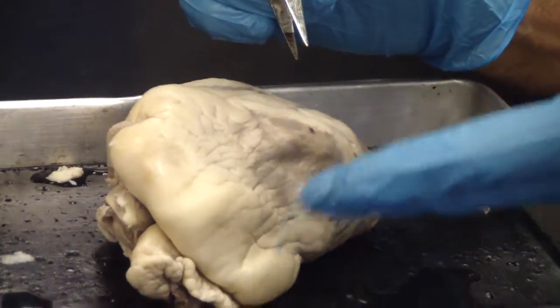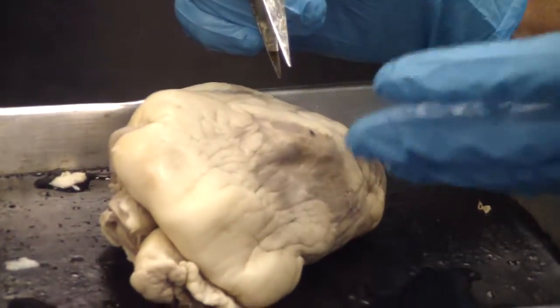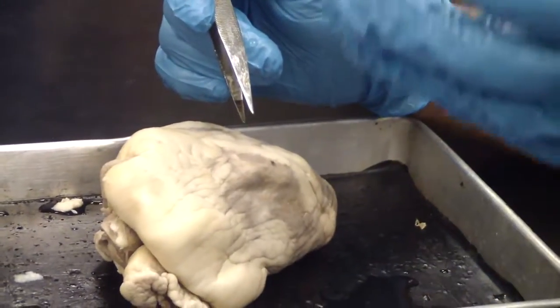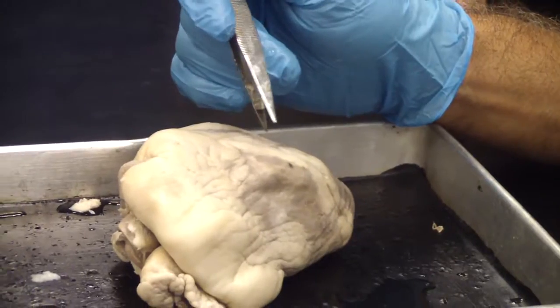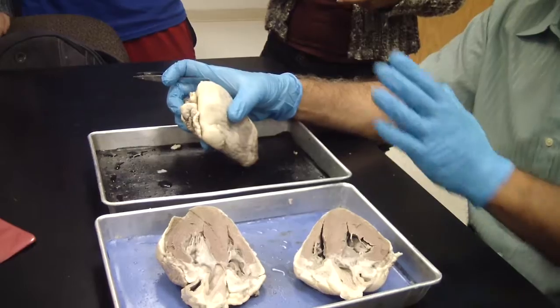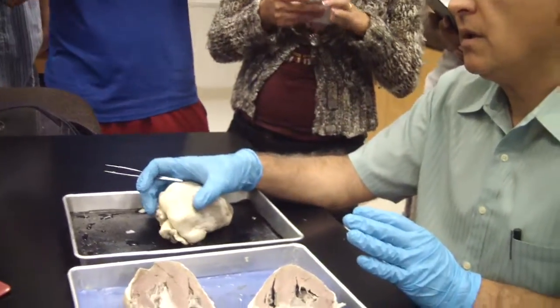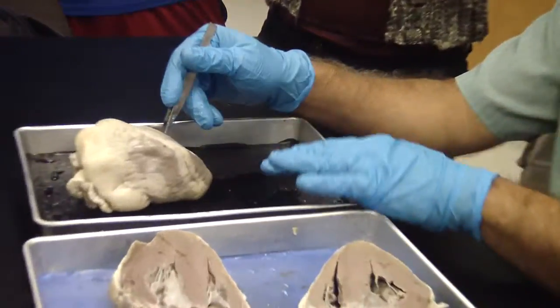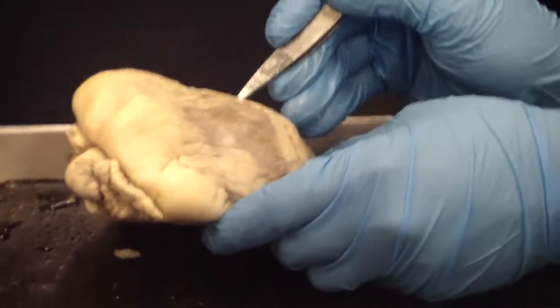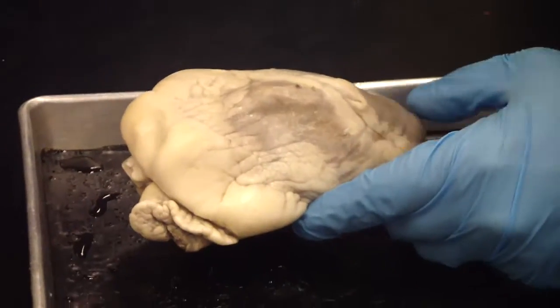The first thing whenever you want to do the dissection of the heart is that you have to establish the right and left. If you establish the right and left, it makes everything much easier, okay? To look at the heart from the outside and establish which side is the right and which is the left, as you recall from the lecture room, we're going to take a look at the anterior interventricular artery or anterior interventricular sulcus.